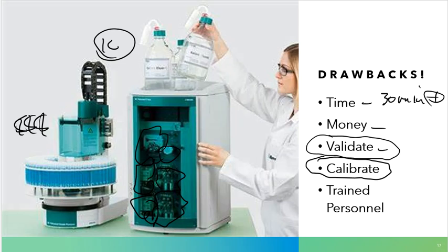The other thing is like a balance needs to be calibrated too, right? So the calibration would be putting some weights onto a scale, making sure that that weight is the number that's the readout on the balance. So if it's not, we've got to go through, we've got to calibrate it, we've got to fine tune it, we've got to make sure that it's back in line and giving us proper readouts of values that we see on the reports or the receipts.